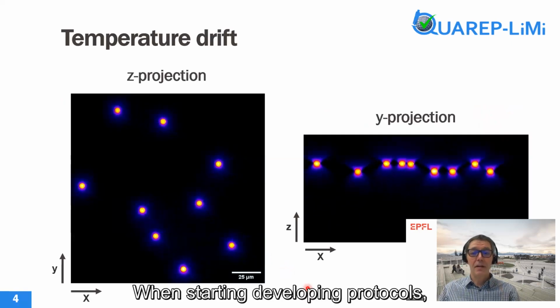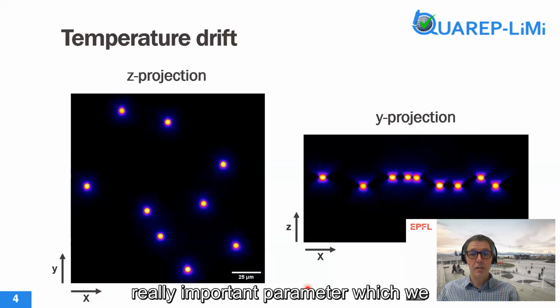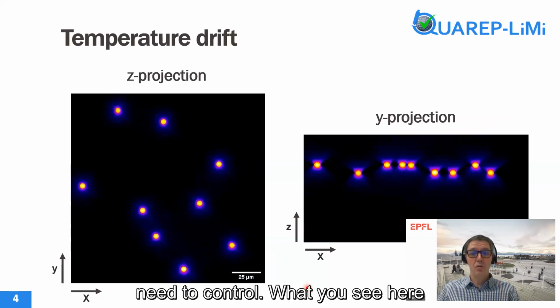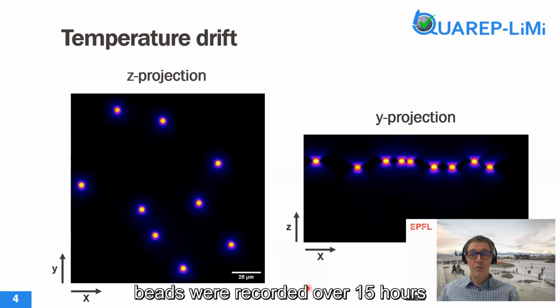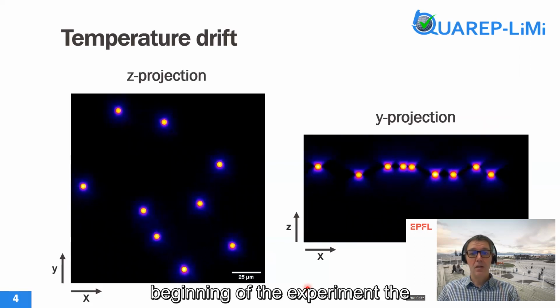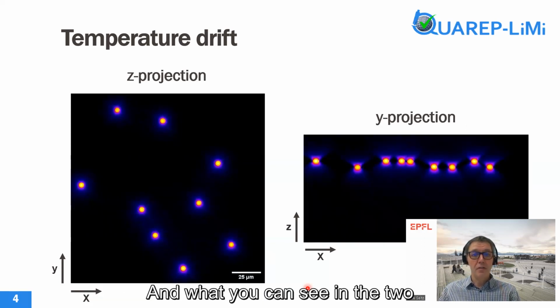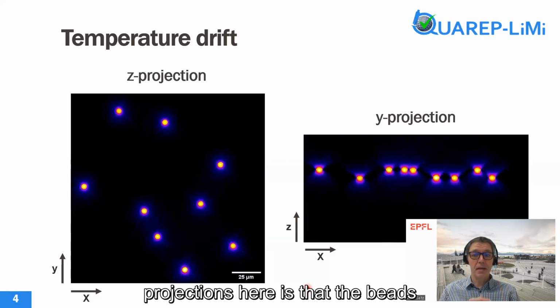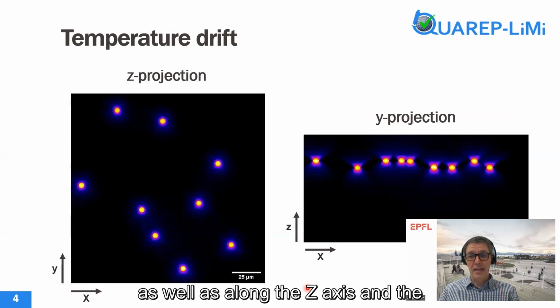When starting developing protocols, one thing became immediately clear, and that is that temperature is a really important parameter which we need to control. What you see here is an experiment where 4 micrometer beads were recorded over 15 hours on a microscope, and at the beginning of the experiment, the temperature was shifted from 26 to 37 degrees. And what you can see in the two projections here is that the beads are moving along the XY axis as well as along the Z axis.